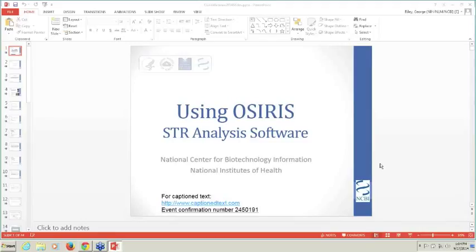Hi, I'm George Riley. I'm a staff scientist at NCBI. I have experience in biology and forensic DNA analysis. I was a forensic DNA analyst and DNA laboratory director for 10 years, with additional experience in laboratory quality systems. Today I'd like to talk to you about the OSIRIS STR analysis software and do a short demonstration. I'm going to start the slideshow at this point.